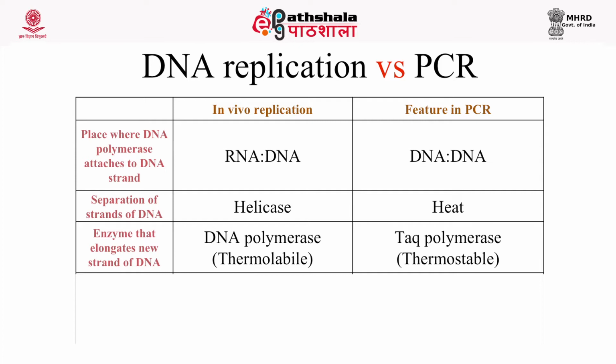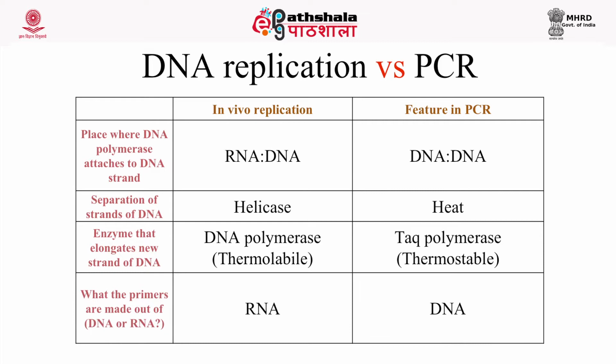However, we use a thermostable Taq polymerase for PCR reaction. The primers in vivo replication are made of RNA, but we synthesize artificially oligonucleotide sequences of DNA in PCR.